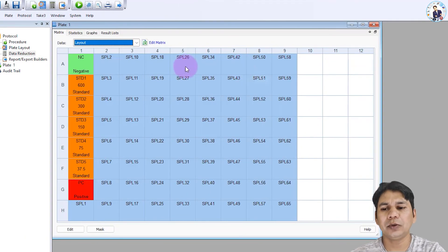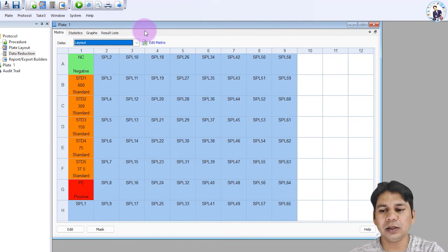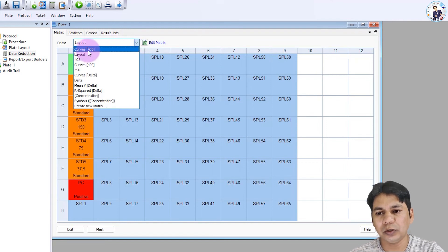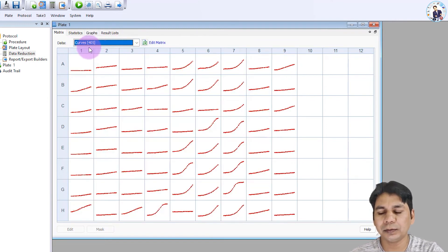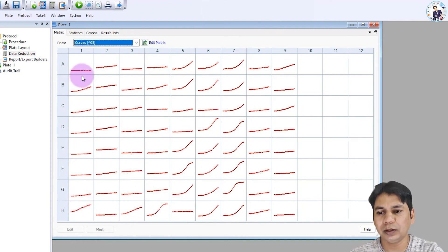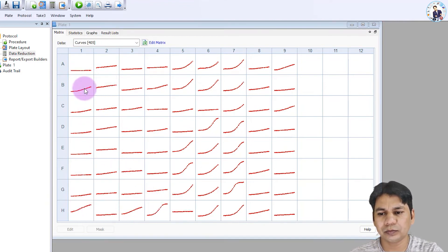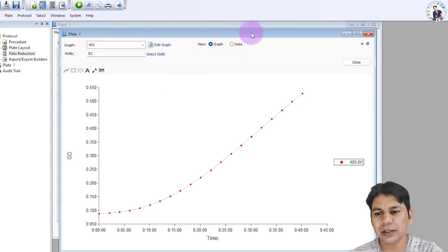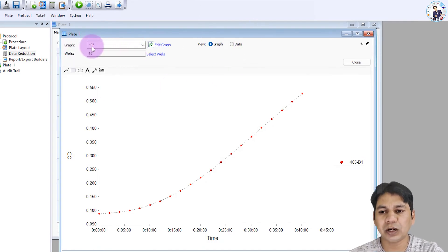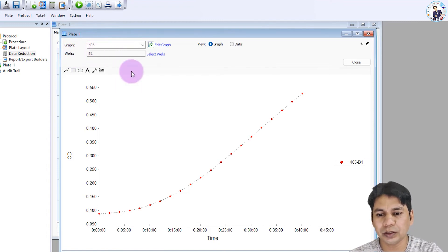Now I am showing the results. I have taken the absorbance from the ELISA reader machine. If you click on the 405 wavelength curve, you can see the values. If you click on any individual well, you can see the graph for the 405 wavelength absorbance of that selected well.